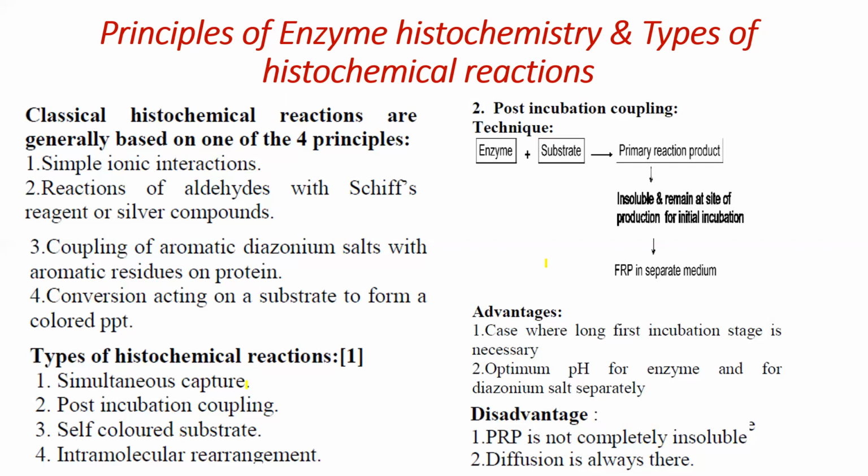Then self colored substrate we already understood, and intramolecular rearrangement also we already understood. So it depends on what type of substrate we are using. Correct.